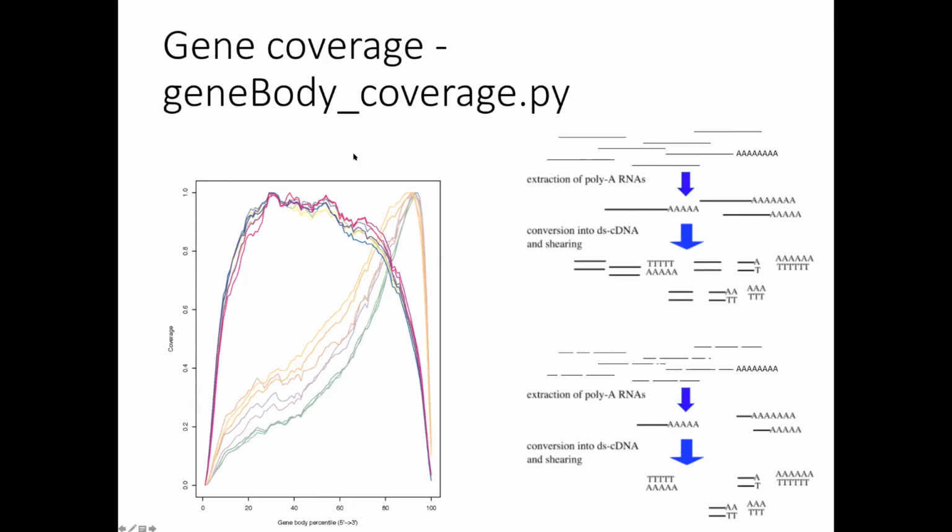Okay, so this is one example of the files that you can get for RNA-specific information. And this is sort of answering the questions: are your reads distributed as you think they are? And in general, you can ask the question, are the reads degraded or not? This is mostly useful when you're working with poly-A-enriched samples.